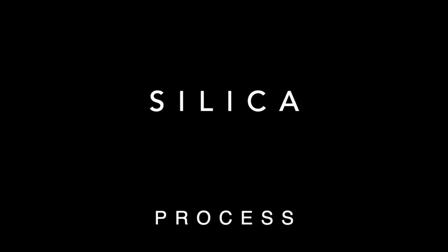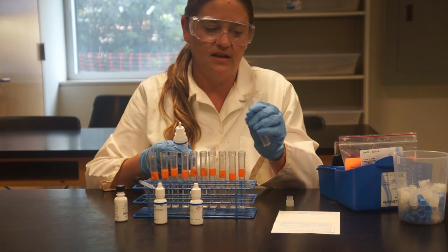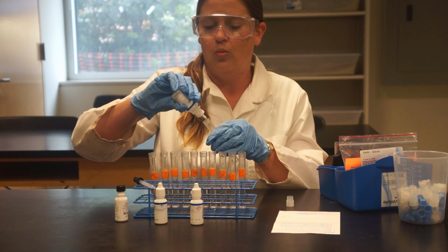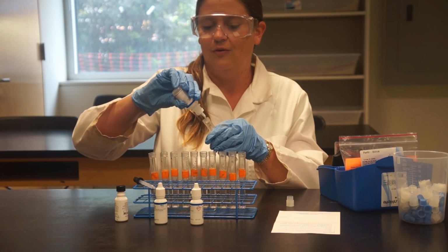Finally, we will look at silica, which some phytoplankton and zooplankton use to make shells. Same as before, we are going to add chemicals from a testing kit to a water sample of each depth, shake it up, and wait a few minutes for the color to change.